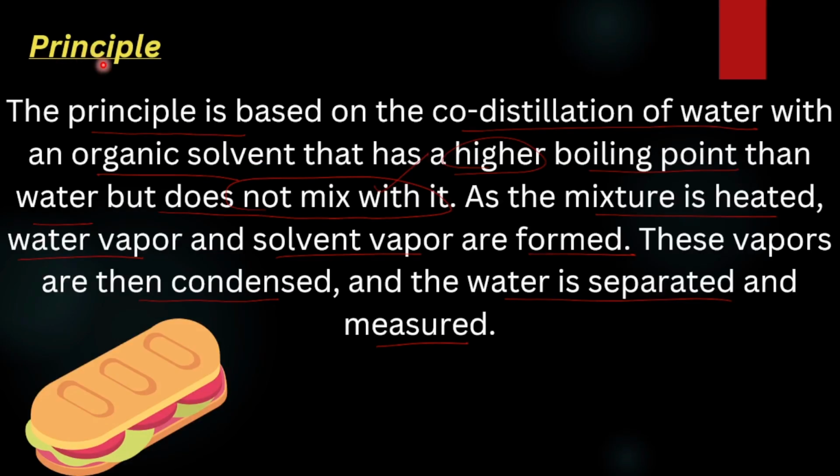Coming to the principle, it is based on the co-distillation of water with an organic solvent that has a higher boiling point than water, but they do not mix with each other. As the mixture is heated, water vapor and solvent vapors are formed. These vapors are then condensed, and the water is separated and measured.